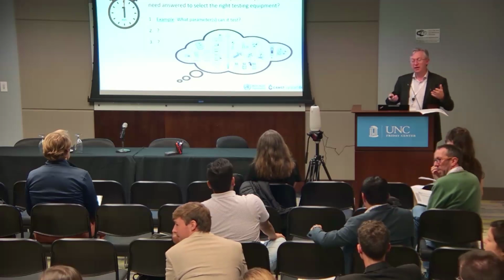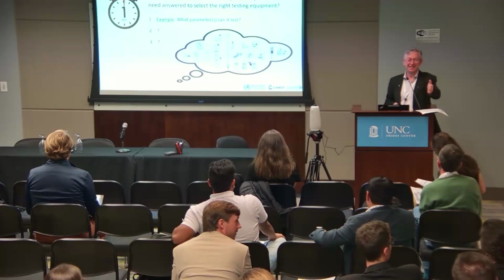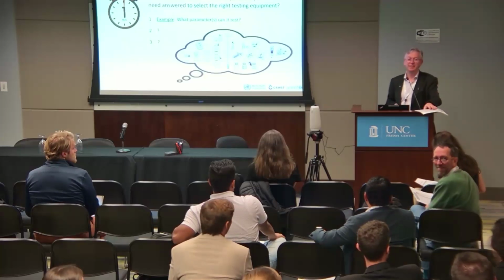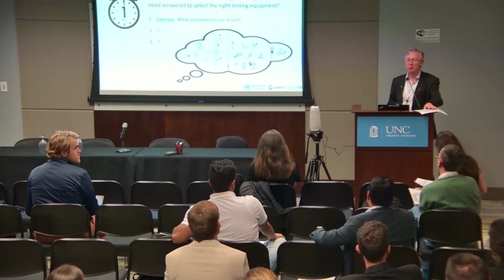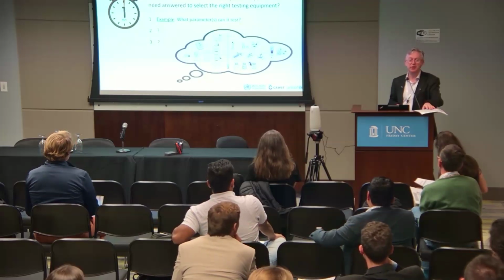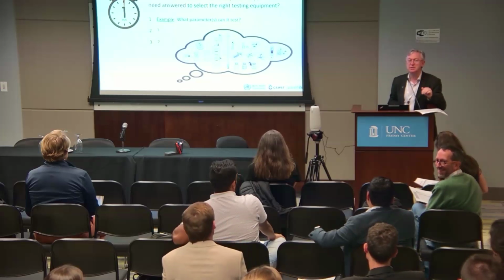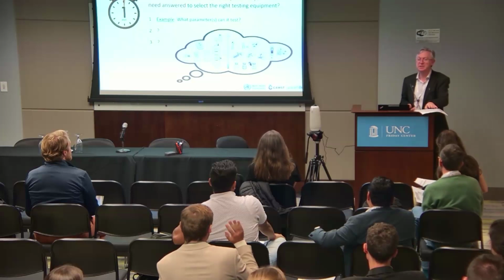Reliable data. Reliable data, maybe a reliable kit as well to get your reliable data. How much waste is it generating? Where do I put it? Yeah, great point. What kind of impact are you having on the environment around you by using that kit? Lars? Enhanced availability of supplies. Yes, your supply chain to keep your test kit going.